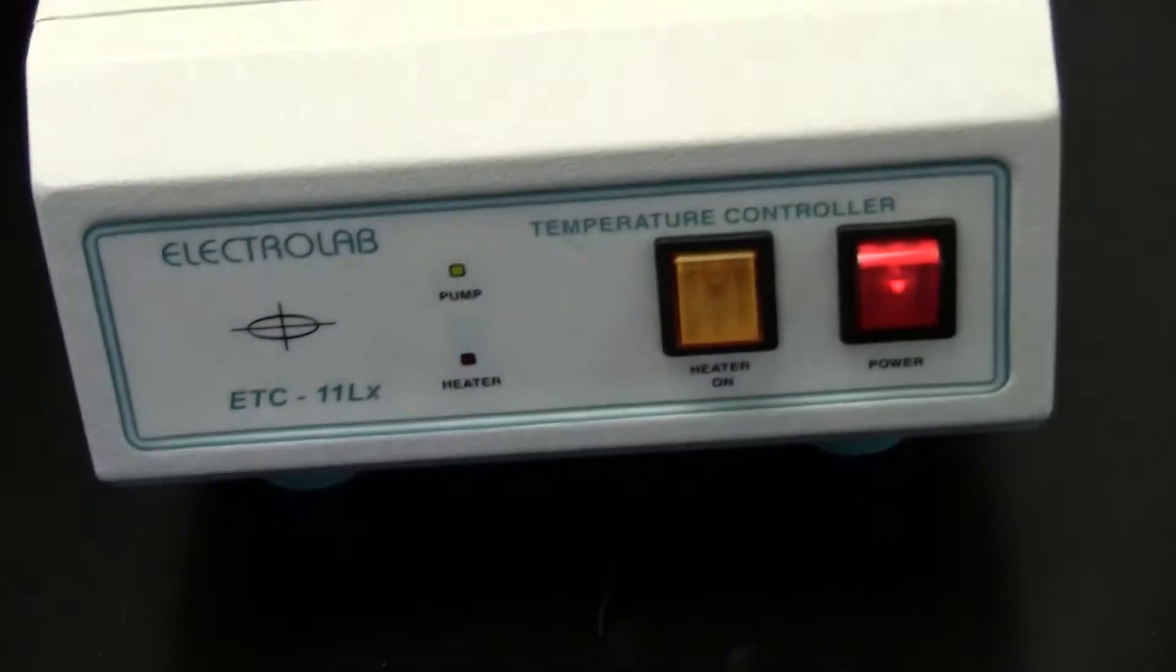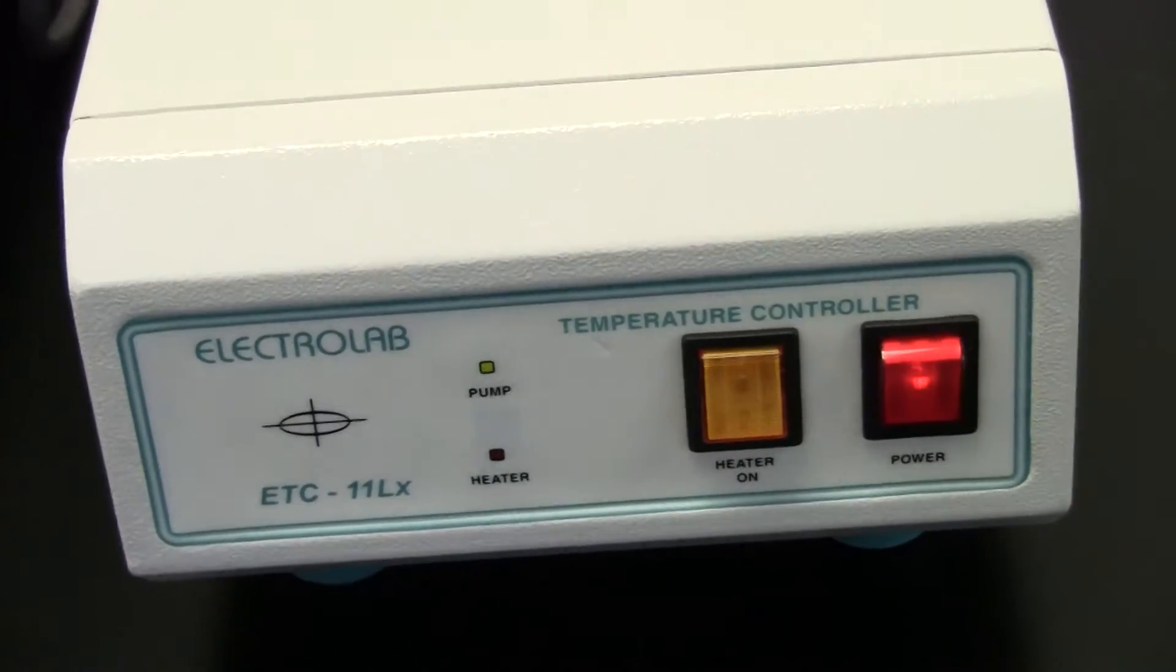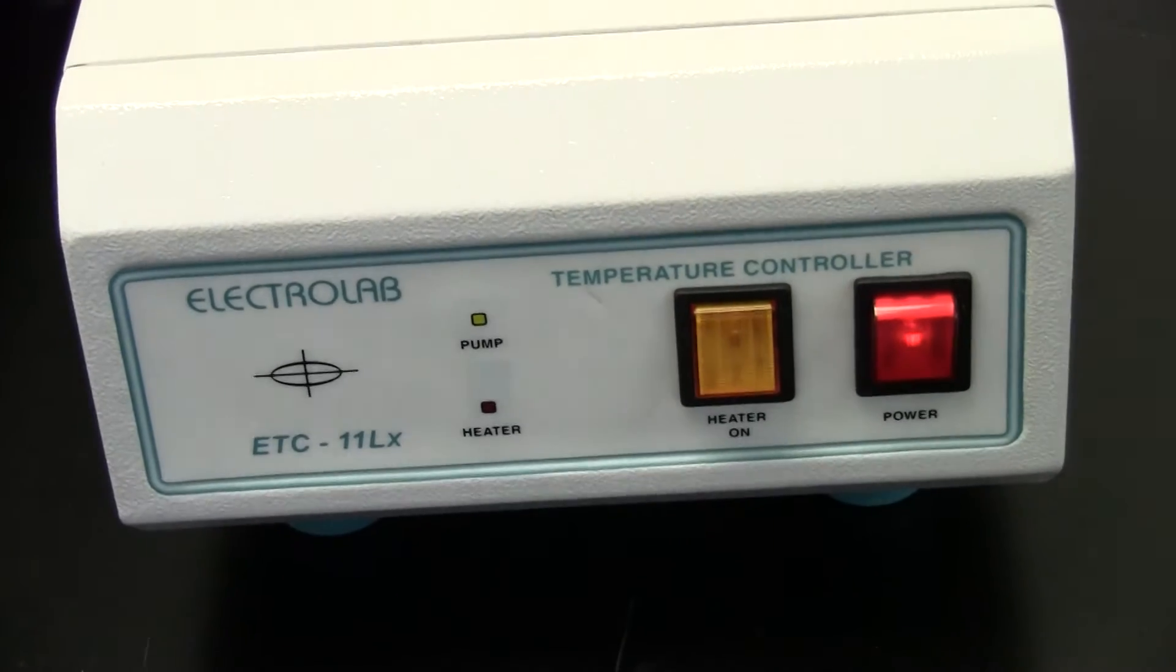The side little unit is your main power source. It also is the pump, bath control.